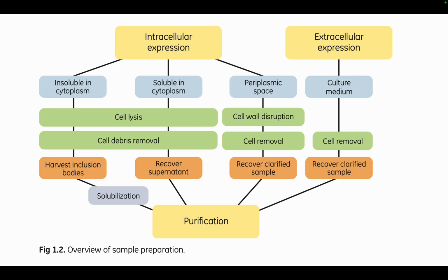So, over the past few weeks, we've been discussing a process called chromatography, which is basically a purification process that we use during protein extraction to ensure that we are able to purify our protein of interest. What that would look like in a protein purification workflow is something like this, where we are expressing our protein probably in a bacteria, maybe using yeast or mammalian system or some other system, but the principle will remain the same. Either you'll express it inside the cell or you'll add some secretory tag to it and it'll be sent outside the cell so you can get extracellular expression.